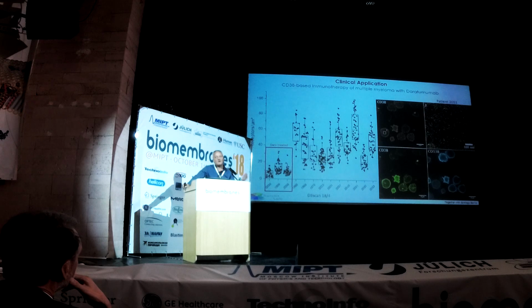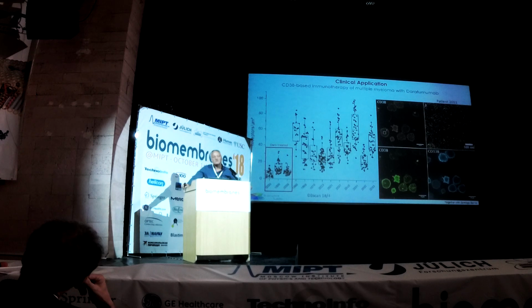So the receptor expression rates decrease. But this is not the case. I do not have the results with me, but our preliminary data simply show that this antibody binds so specifically and so stably to these receptors that even after days, they are still on these cells. If you use other antibodies directed against a different epitope, you still see higher expression rates even in these patients.